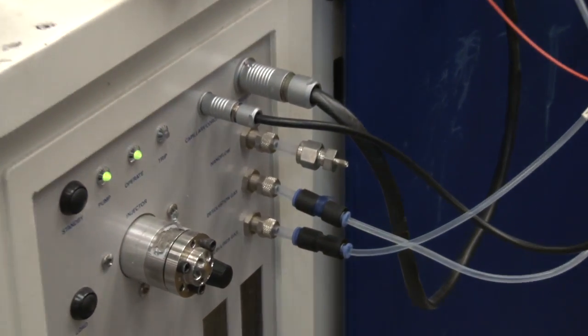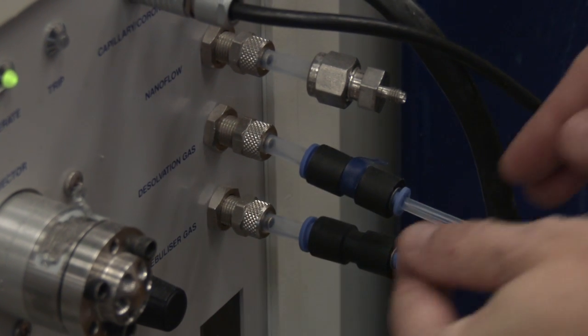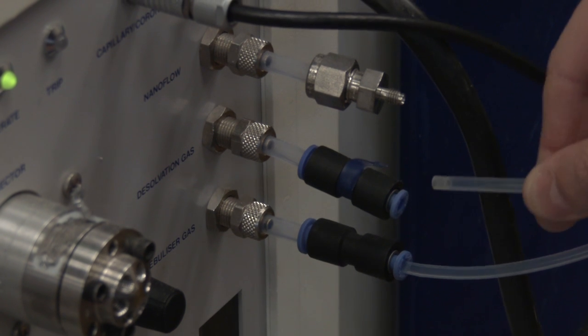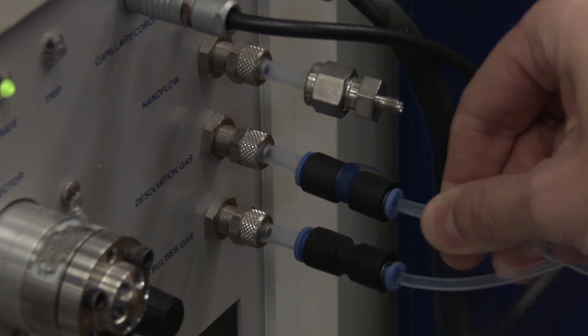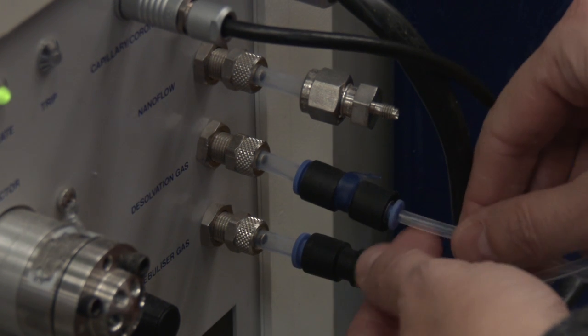Most modern mass spectrometers possess these push and pull connectors on the high-pressure gas lines. They can be removed when the gas is off by pushing the blue end piece towards the back, towards the black center piece, while simultaneously pulling the tubing out in the opposite direction.